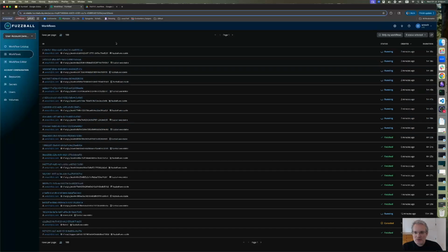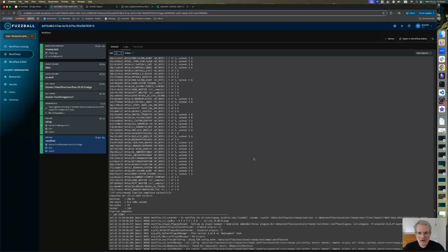So this will run through the entire pipeline until it's done, and then we can reconvene when that's completed and look at the outputs. Okay, we're back. After a little bit, the Nextflow pipeline execution for this nf-core RNAseq pipeline finished. For those of you with good eyes, you'll notice that this is actually a different workflow ID because we had to restart the pipeline once due to reasons completely unrelated to either Nextflow or the Nextflow plugin. You see the pipeline completed successfully.